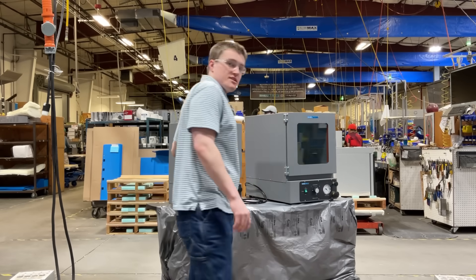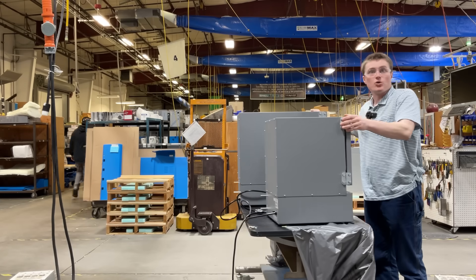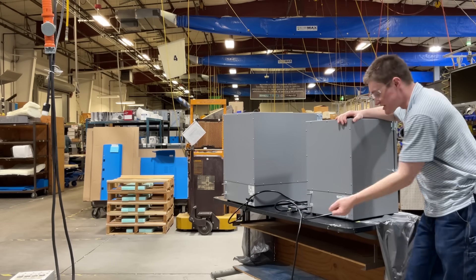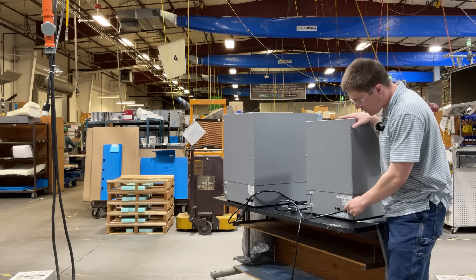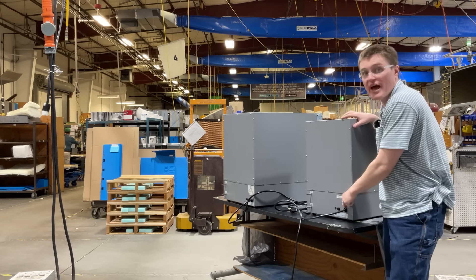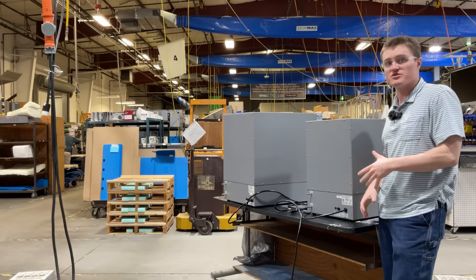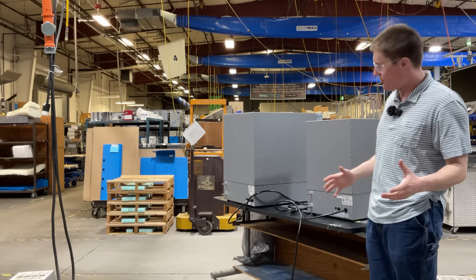The first thing you will notice is that on both of these products, the power cord is hardwired to the unit, meaning there's nothing to connect or disconnect right out of the box. Located to the left of this, you will see the externally located fuse drawer. This will allow the user to replace the fuse easily in the field without having to contact a service technician or anything difficult like that.